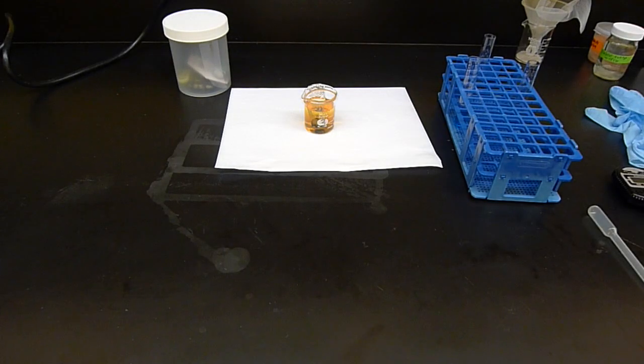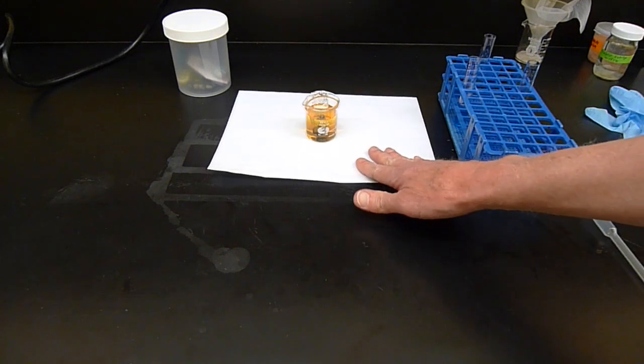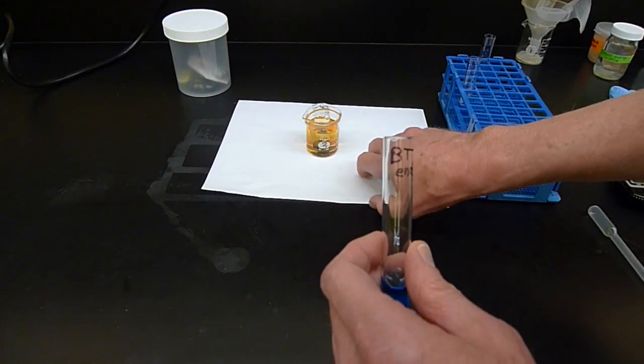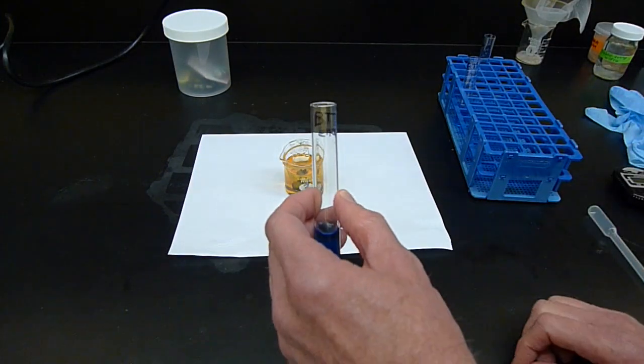Next thing we're going to do is a Benedict's test on the solution. Because again, remember that Benedict's test is going to be testing for the presence of a sugar, in this case glucose.